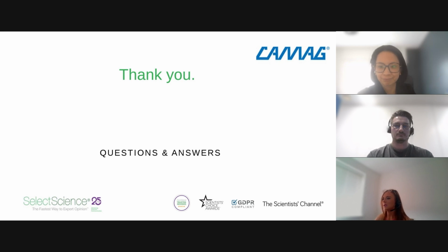So this next one here is, how is the industry easily detecting increases in intensity? Following this study, what we have done at CAMAG is that we have implemented in our software one impurity tool where you can set acceptance criteria, like Paul has explained during the webinar, and you can select the specific marker, so the RF value, and set the acceptance criteria, and the software will check at this area and tell you if the signal is increasing, and like this, if it's outside of your acceptance criteria.